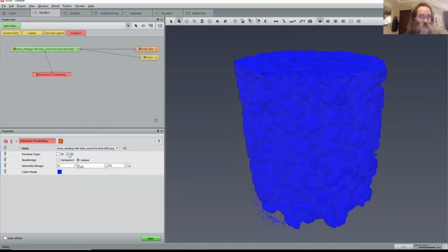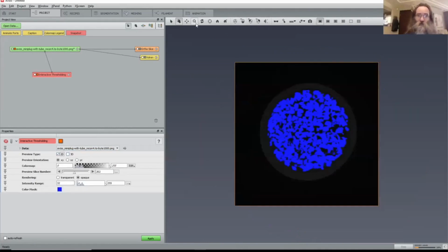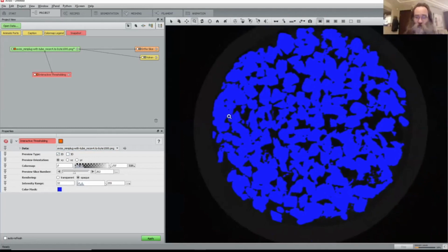Let's go back to the 2D preview for that, and back to the correct orientation. One hint that you have is actually here, the histogram. You see three peaks of the histogram essentially, and then not a lot. So again, we don't have many high intensity voxels, and you see that here, although we're only displaying things where we don't see anything in the histogram, there are a few things marked.